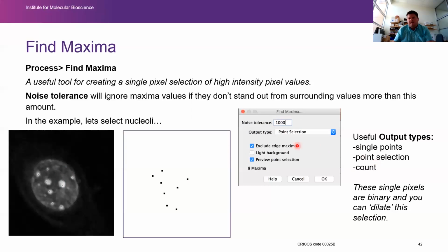You can also get counts. So if you had just nuclei, you can perform a median filter, something like a median of 7 or 8, and blur all of them, and then just say find those peaks in the image, and it would give you a single line output of how many peaks there were. So, slightly different use cases allow for making this type of selection.